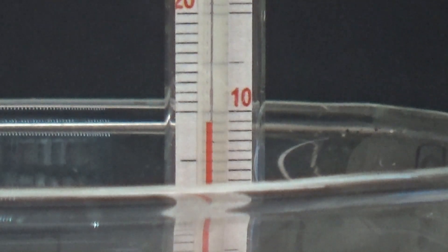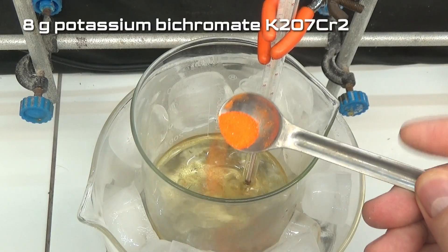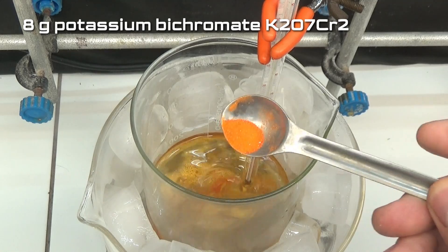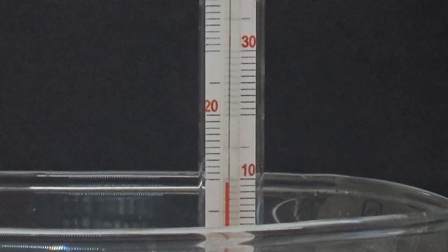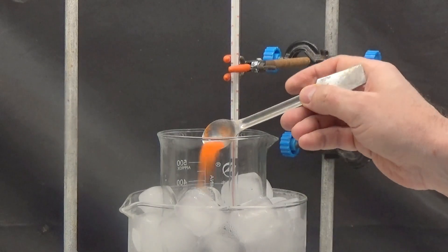When the temperature is between 5 and 10 degrees, add 8g of potassium dichromate in small portions. Do not allow the temperature to exceed 10 degrees. The 8g are added in a time of 20 minutes.